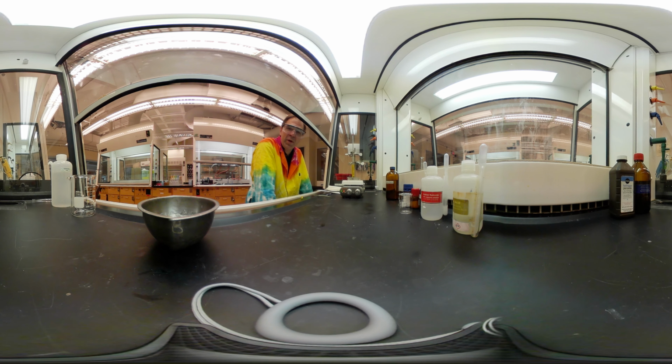All right, welcome back. So I went ahead and took a little break there because it was taking forever to heat this test tube up, and I didn't think you really wanted to watch it just heat up, even at 1,000 times speed. So I just wanted to let you see here we do have the reflux that's going. So we've got nice bubbling going on. I've got a thermometer in here to monitor the temperature at the bottom because there's a very large temperature gradient here where it's about 102 at the bottom, but only about 70 at the top. So this cools down pretty quick.